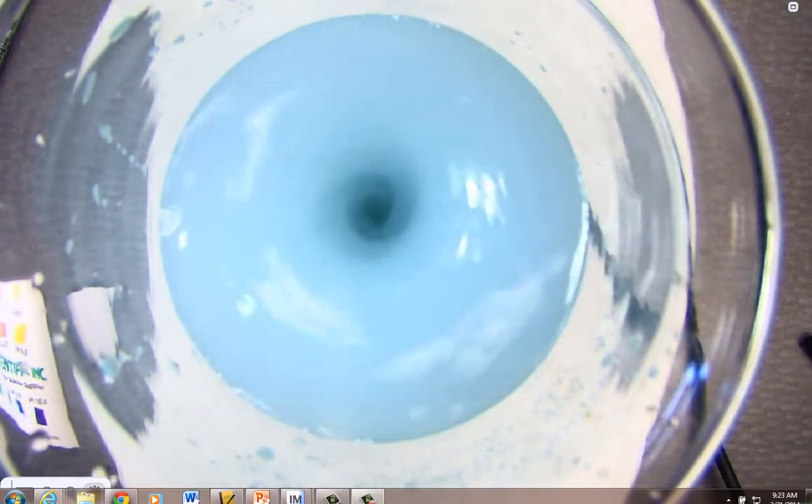The purpose of this demo is to cause a stress. Let's take this hydrochloric acid, and I'm going to put a good squirt in there — observe the color changes as they appear. Here comes the acid. Let me do it again. That's a beautiful thing about Le Chatelier's — we can do this over and over. Le Chatelier's principle: whatever I do to cause a disturbance or a stress to the solution, the solution is going to counteract that stress to get back to the equilibrium position, to get back in balance.